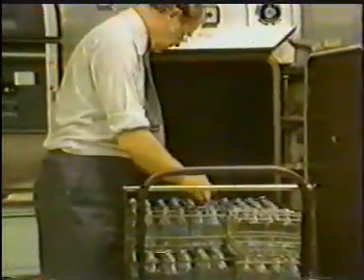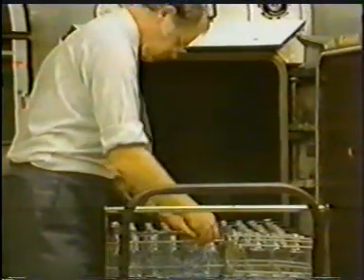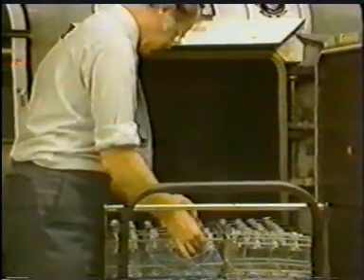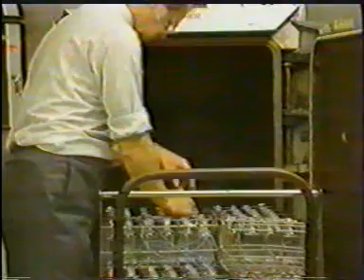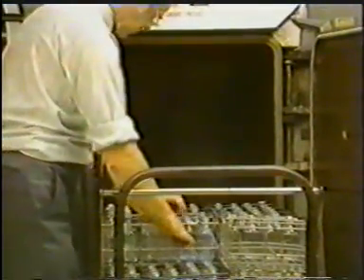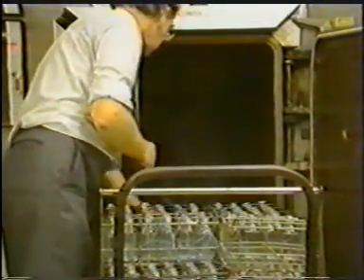The quality control pharmacist is involved in monitoring the autoclaves and hot air sterilizers which are used in the manufacturing unit. The quality controller must satisfy himself that the necessary level of testing is being carried out on the autoclave, that regular weekly maintenance is taking place, and that records are being properly maintained.